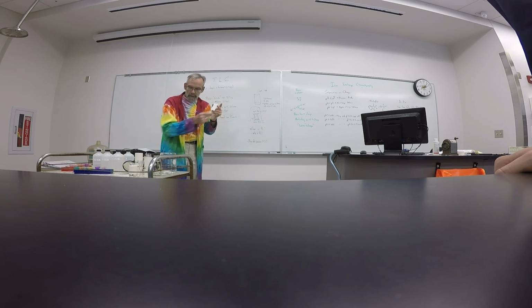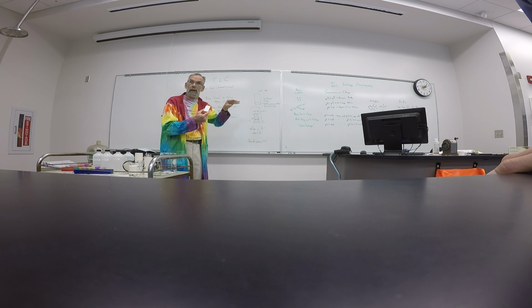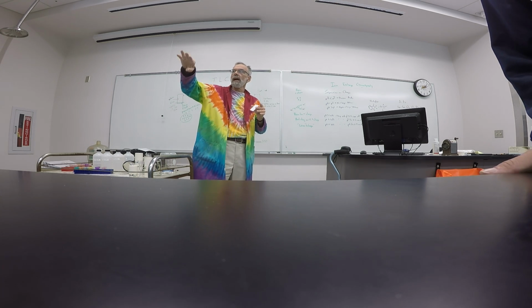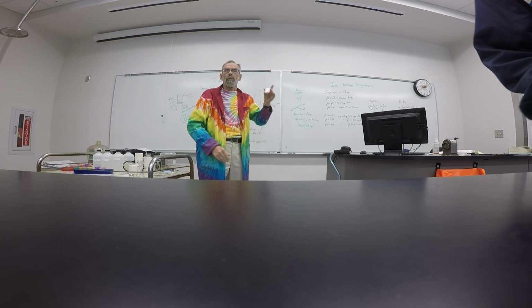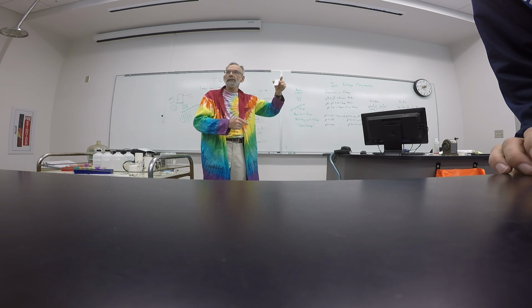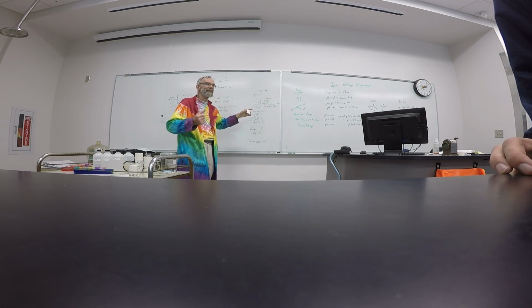And since you don't have room on this little guy to have all 6 amino acids and your unknown, what I want you to do is have 3 amino acids in your unknown. And then between your 2 groups, you cover all 6 amino acids. So you do 1, 3, you'll do another 3. You guys, similarly, each side of the bench, one group does 3, the other group does the other 3, so you have to coordinate, and you put your own unique amino acid on there, and then you can compare. And between the 2 groups, you'll have it all. You'll have it all. Isn't that great?